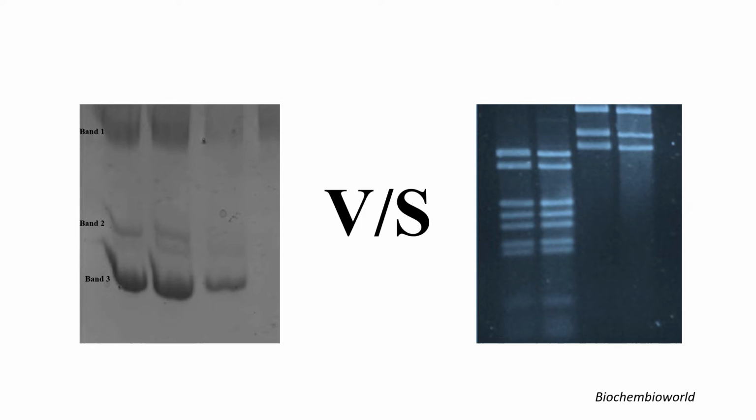Whereas on the right-hand side, the discontinuous gel system end result, the bands are very crisp, with much greater resolution in comparison to that of the continuous gel system.